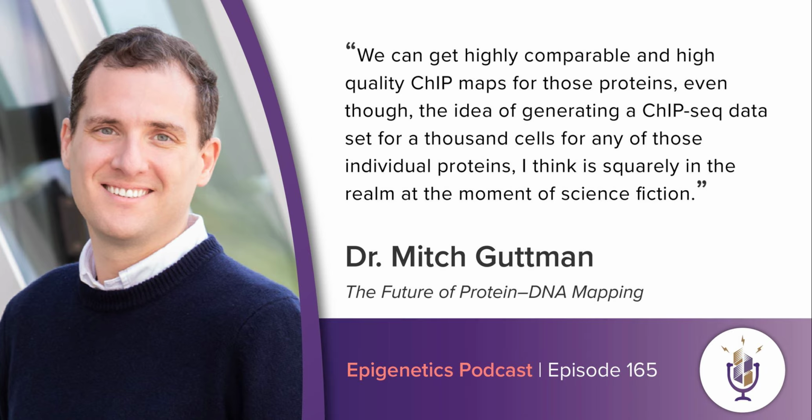So, for example, we can use many different antibodies against CTCF or any transcription factor or chromatin protein of interest, which may include antibodies that may not have previously been validated for ChIP. In fact, many antibodies that we know can work well for other applications have simply not been tested for ChIP.